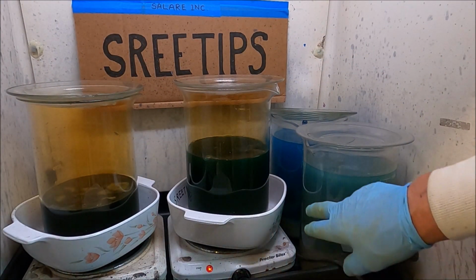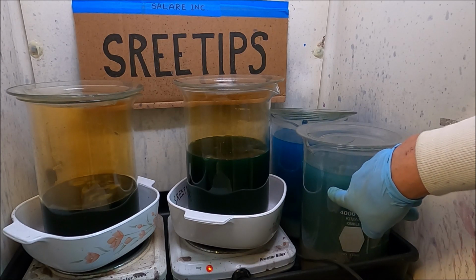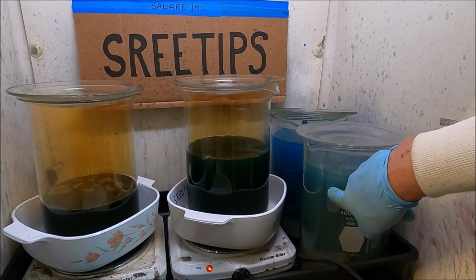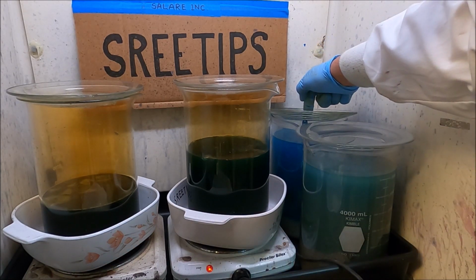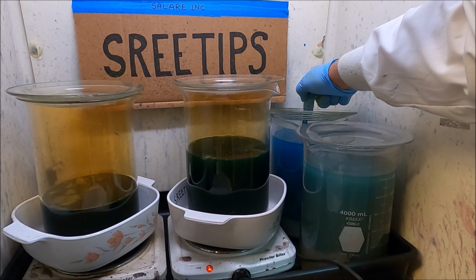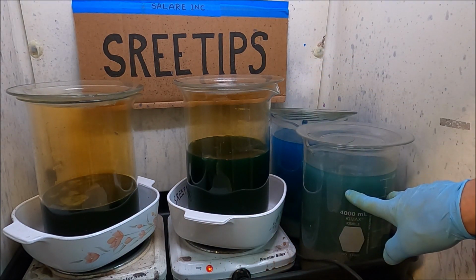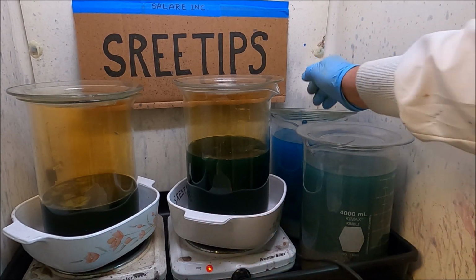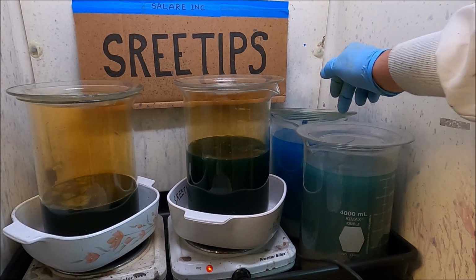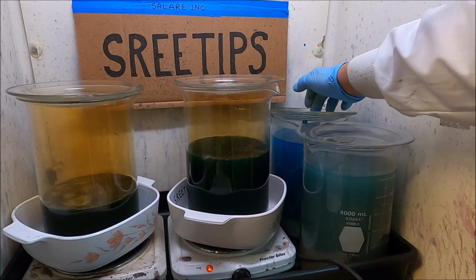Just a little review here. These two beakers have the solution that I rinsed off of the silver cell slimes when I first started. There should only be silver in those solutions. That's why I'm cementing the silver out with copper. There won't be a whole bunch of platinum group metals or palladium in there because I just rinsed the silver nitrate off the silver cell slimes and then cemented the silver out here.